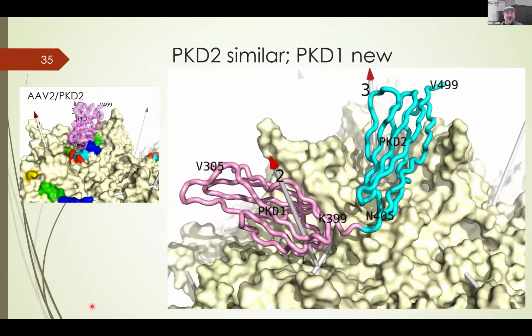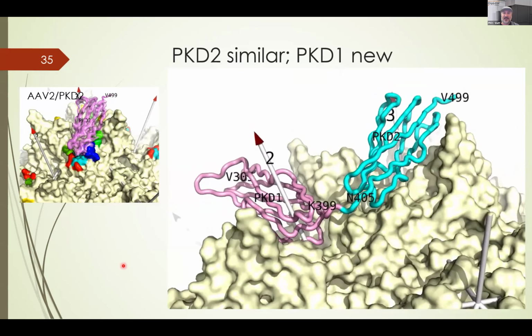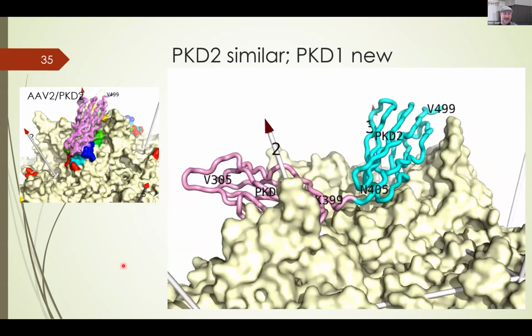So you spoke about ensuring that the maps going into a difference map calculation are scaled properly. How are you doing that?